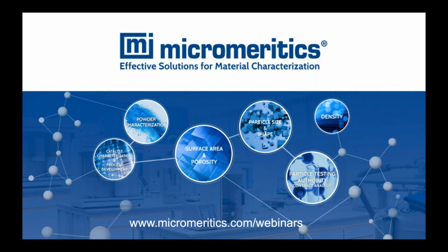No, not really. I would say that the world of catalysts is a very challenging research field, and usually a single technique provides a very limited piece of information, and we should combine several techniques to better understand the behavior of a catalyst, especially when studying catalysts after a chemical reaction that are submitted to phenomena like poisoning or fouling, and to study the regeneration effect and so on. So it's a complex matter, very challenging, and also I want to thank many customers. We are finding very interesting and unexpected results. So even after many years working in this field, every day I learn something more.